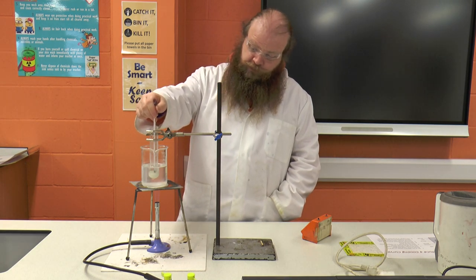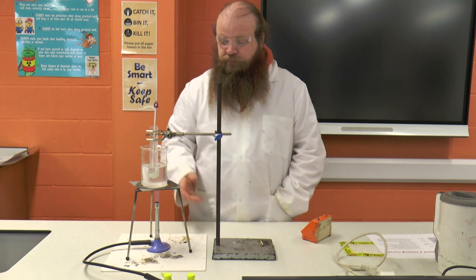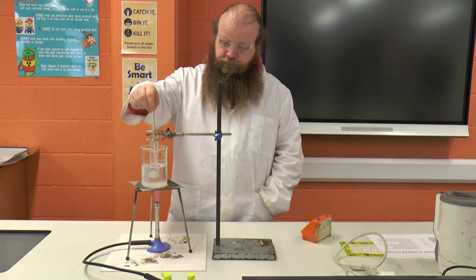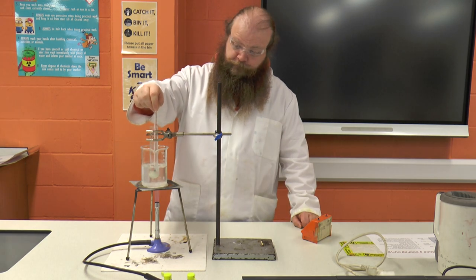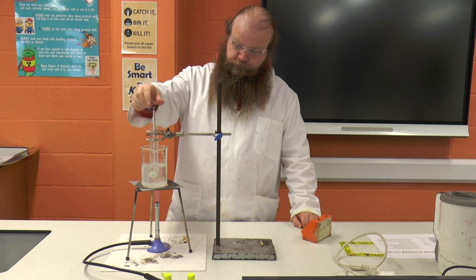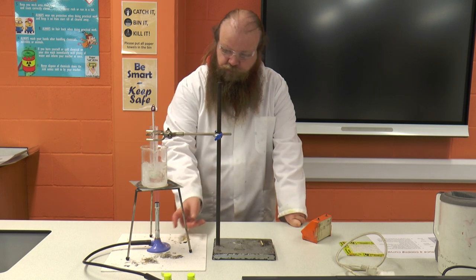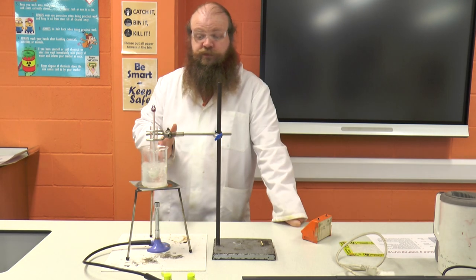It's important that we make sure the stearic acid is completely melted before we begin taking any readings — it does take a couple of minutes. We can control the rate of boiling of our water by just opening and closing slightly our valve to change from a roaring flame to just a standard heating flame.